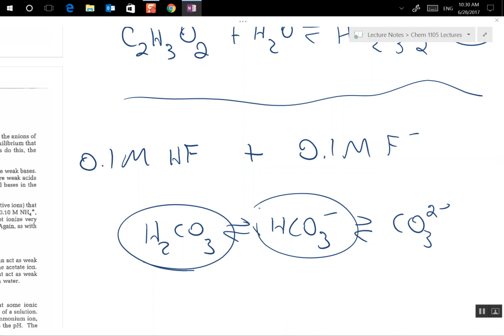So the other part of this experiment, if you turn to the next page of your report sheet, is we are going to investigate the buffering system of an acid-base buffer. Okay? So first, you're going to take HCl, which is not a buffer. It doesn't create a buffer because to create a buffer, you have to be able to create an equilibrium. HCl doesn't create an equilibrium. It's just a strong acid. You're going to add, so effects of HCl on pH of a buffer. So first you're going to take some water and you're going to add drops of HCl to it and you're going to watch the pH change very quickly.